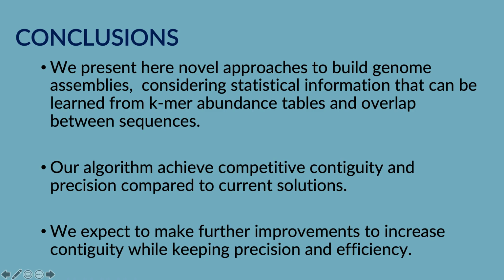So, in conclusion, we present a novel approach to build genome assemblies considering statistical information that can be learned from k-mer abundance tables and distributions of different features. Our algorithm achieved competitive and, in one case, best contiguity and precision compared to current solutions.